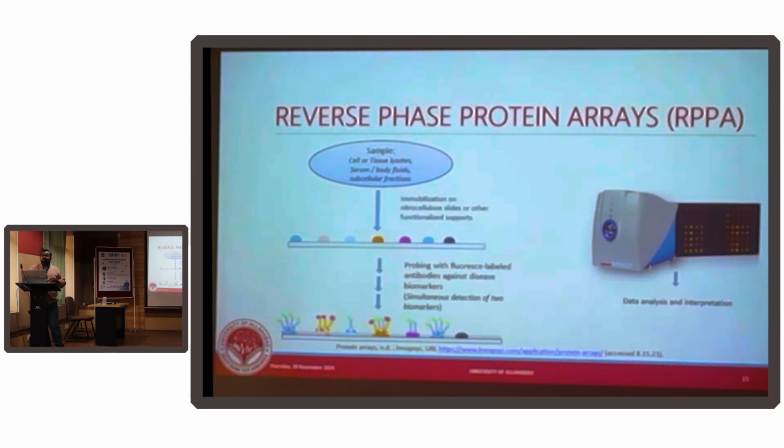Since we are talking of big data, these are more of a high throughput approach that you need to think of. In a high throughput approach, we don't talk about one data set or 2 data points. The data points should be large. Here the patient number will be large, and the number of samples and assays you're doing should be greater.